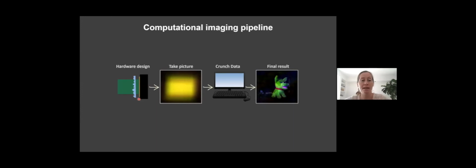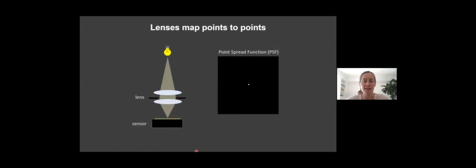So we are messing with the light rays as they come in, but not in the same way as a lens. And this gets you a camera that's really cheap and compact because you don't need that space between the lens and the sensor. So if you think about comparing this to a regular camera, it is often characterized by its point spread function. This is essentially the impulse function of the system. So you put a point out in your world, in the scene, and what does the sensor measure for a point in the scene? Ideally, the sensor would just measure a delta function or a point.